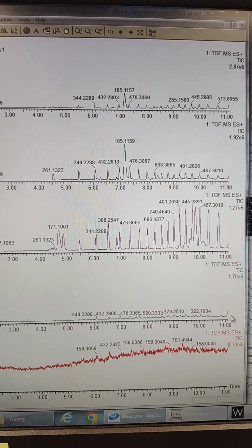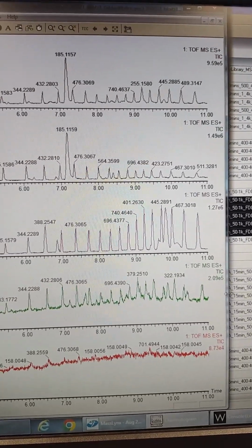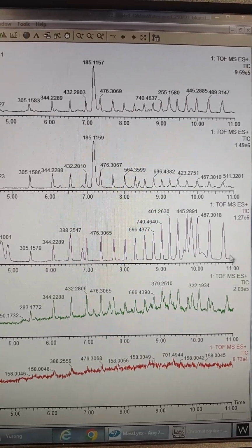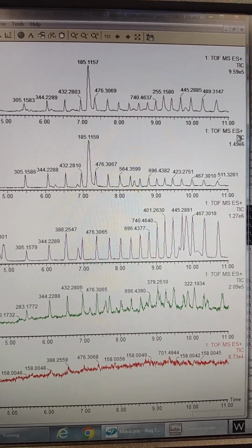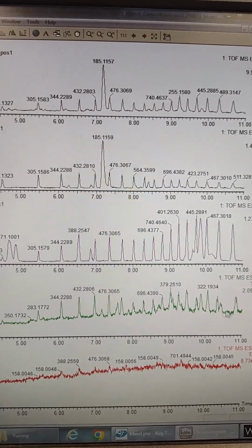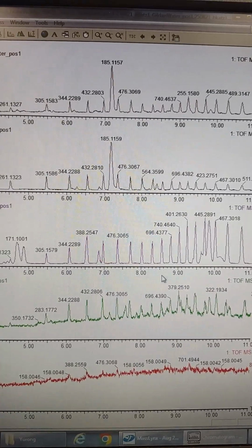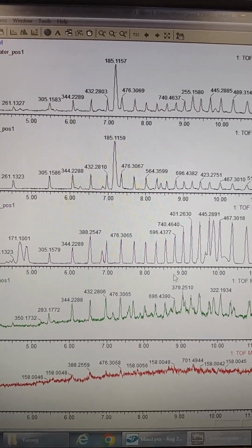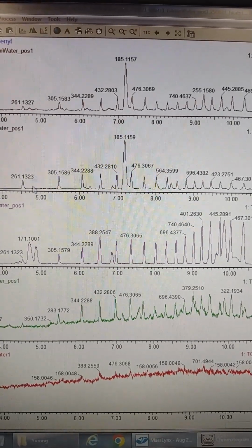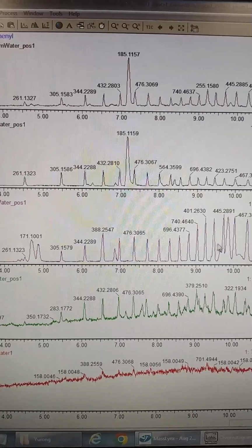And you can see, if we look early, and we look at the signal, the Viori is much, much cleaner, much lower. These are all up in the almost 1e to the 6. This is a 2e to the 5, where it's pretty close to baseline. You can see a bunch of these little blips. All these little blips typically are polymers, short chain polyethylene glycol, propylene glycol polymers that are being separated out by the column.